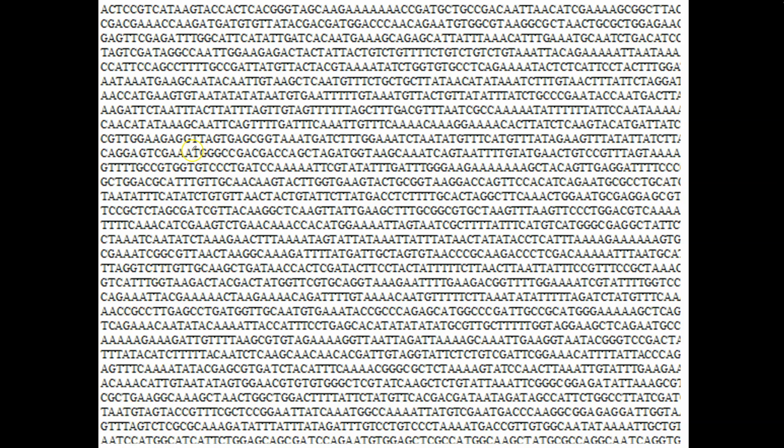But if we can decide that we're trying to isolate this gene here, it's possible that we can find some sequences that are unique. So what's really important here is that in order to do PCR, you have to know something about the gene. You have to know its sequence or the sequence of the DNA right to one side or the other of it.